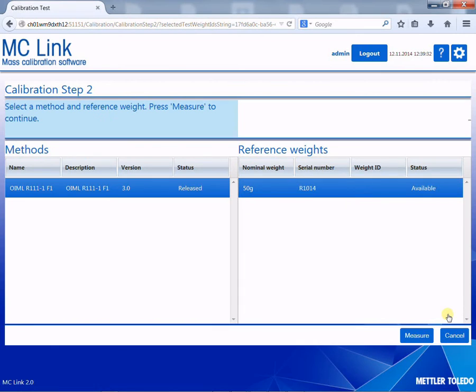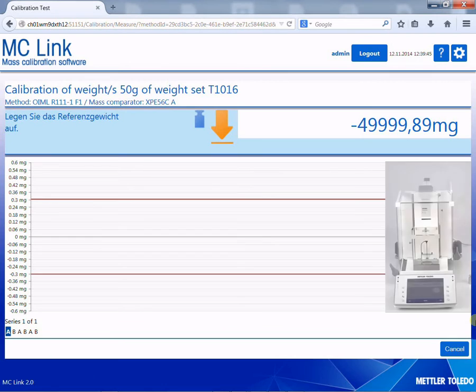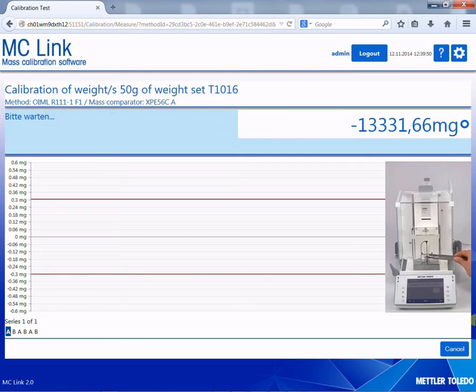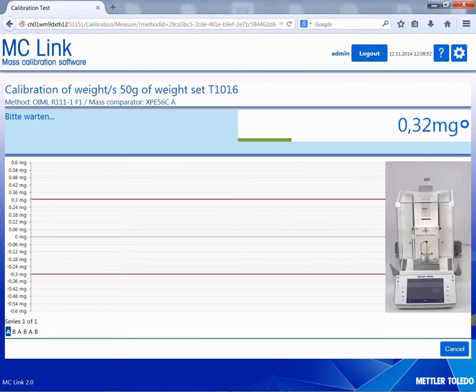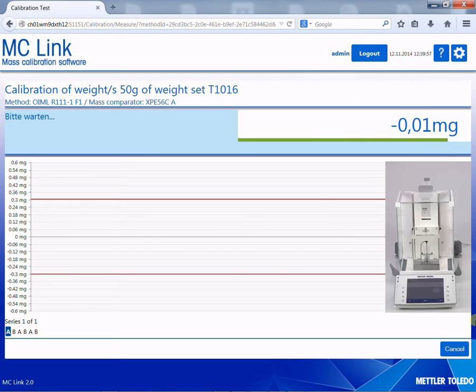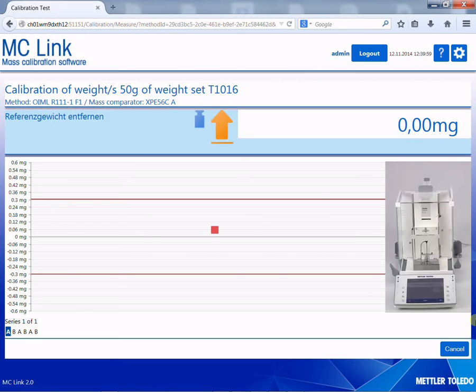MCLink proposes weighing process and reference weights based on filtering, according to the accuracy requirements of the test weights, in combination with the previously selected comparator. This means a complete uncertainty analysis is performed in the background for each combination, and only feasible combinations are available.